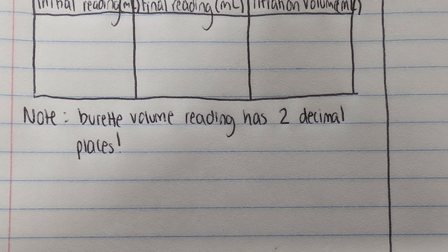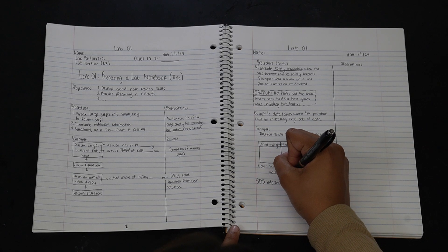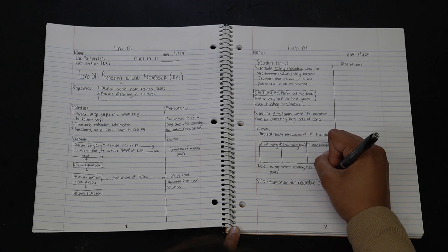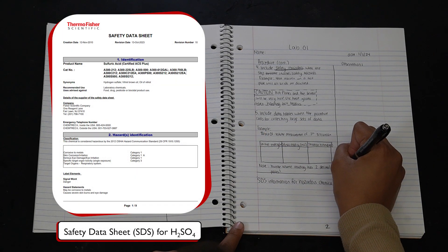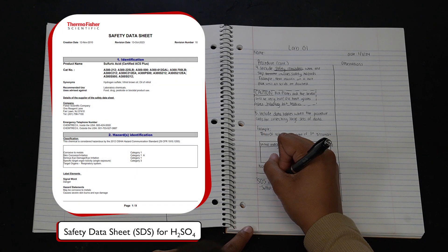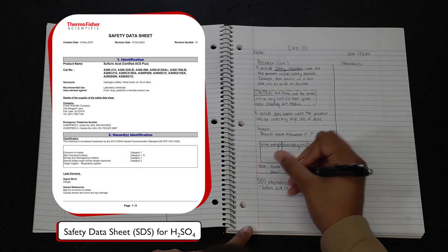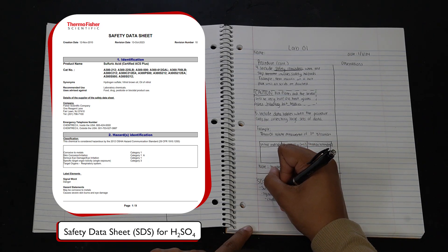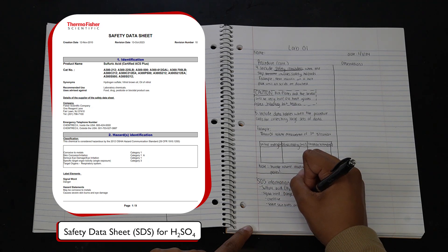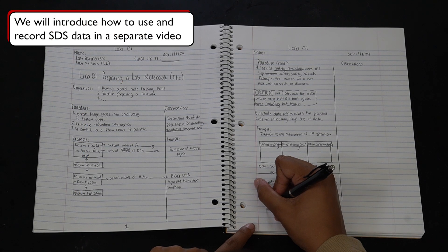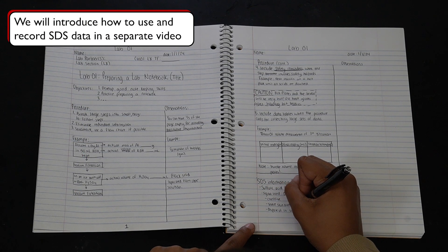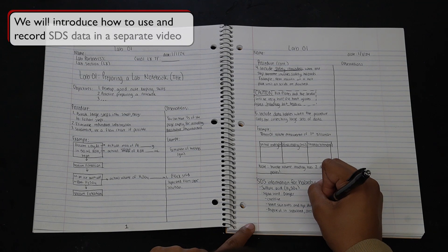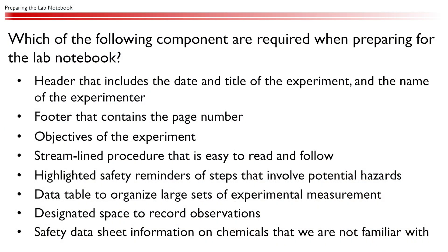After the procedure, the last section of the lab notebook is the safety data sheet information, the information on chemicals, or the SDS information. SDS information is required for labs that involve hazardous chemicals that we are not familiar with. We will discuss how to record SDS information in a separate video when needed. Which of the following components are required when preparing for the lab notebook?